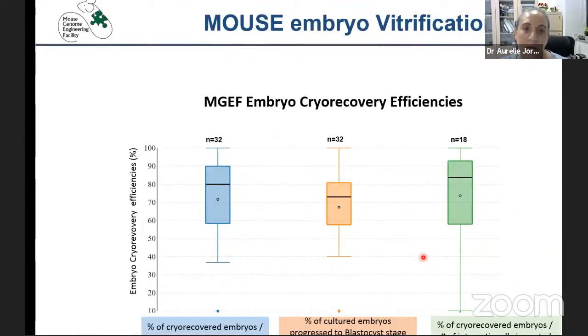This is the embryo cryorecovery, so we have less demand for that, but that works well. Most of the recoveries that we have done are for clients that import embryos from these international consortiums. So there's many consortiums around the planet that have stocks of mouse stocks, sorry, and they're preserved as embryos. So they import the frozen embryos to our facility, and we're able to revive these lines from the cryopreserved embryos.